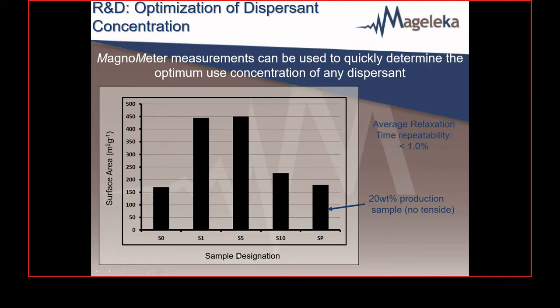What we see is that the concentration of dispersant was increased. The wetted surface area also increases, which means you're getting better dispersibility. But once we go above 5% and go to 10%, we're clearly now overdosing because the surface area has gone down. And you're getting aggregation now, and this is probably a result of particle aggregation through depletion flocculation because of the nature of that naphthalene polycondensate.